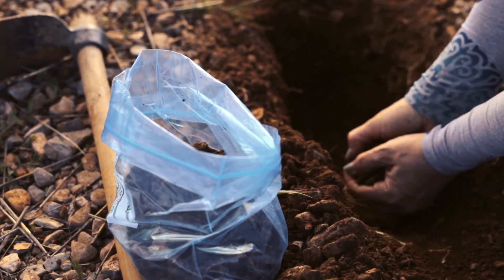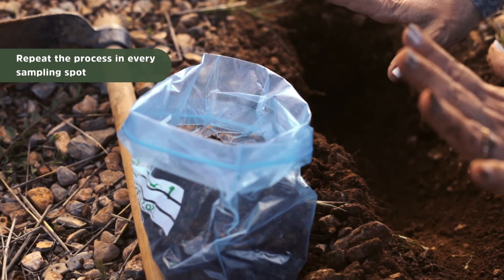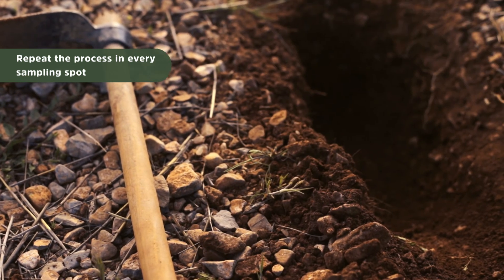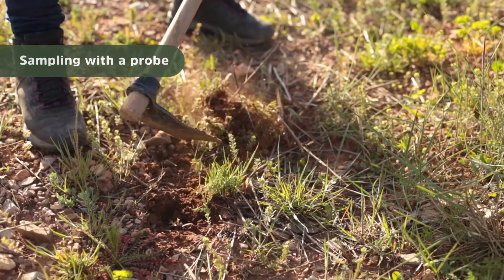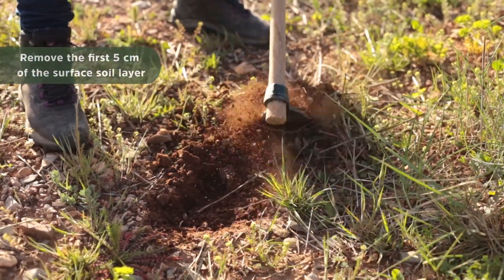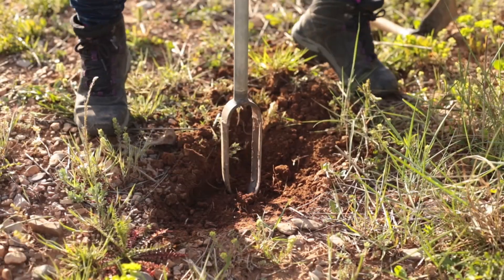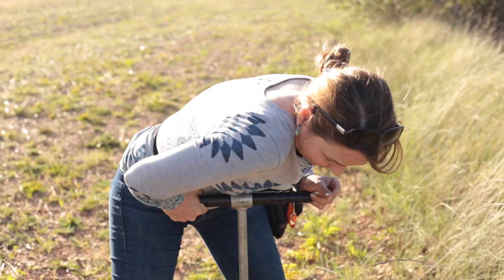Then you will repeat the process for the rest of the area and mix all the samples together. If you have a probe or an auger — I like the Edelman type — you will just take off the first five centimeters and dig in with it. It's a lot easier, but of course you have to have it.